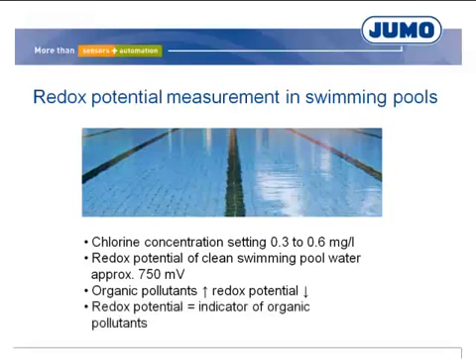Because the chlorine concentration in the application is set to a stable value, the redox potential is a parameter for organic pollutants. If the redox potential falls despite filtering, the filter system must be inspected.